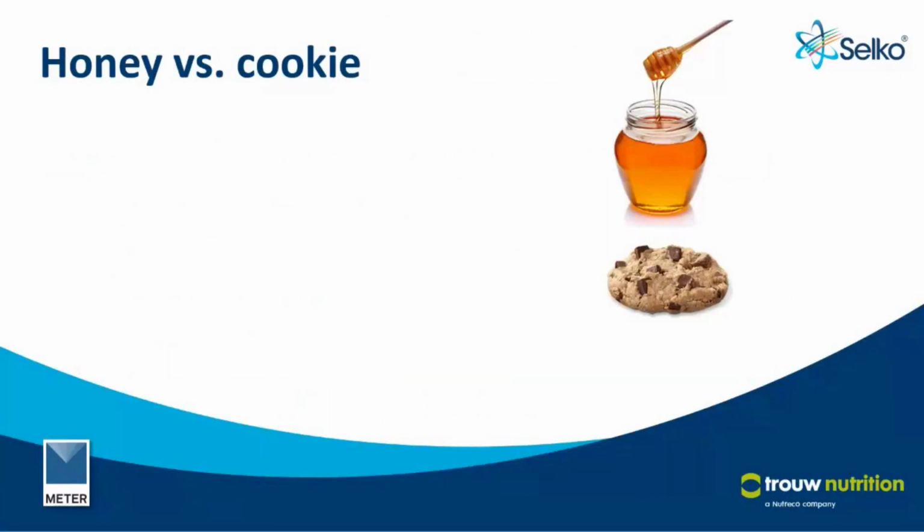I have a little demonstration here about honey and a cookie. So if we look at these, we can tell and look at the moisture content. It would probably be easy to see which one is going to have higher moisture content. The honey is liquid and the cookie is nice and crunchy, so we would expect that the moisture contents would be much different, and it's true. The moisture content in the honey is around 18%, and the moisture content in the cookie is only 5%.